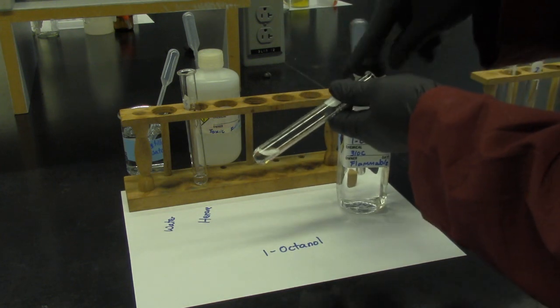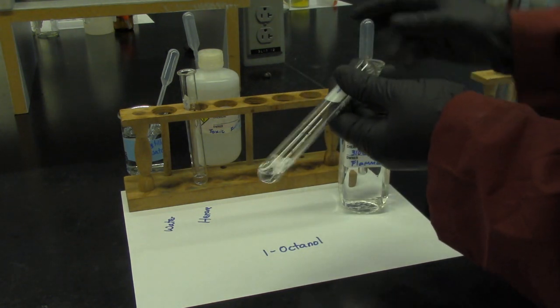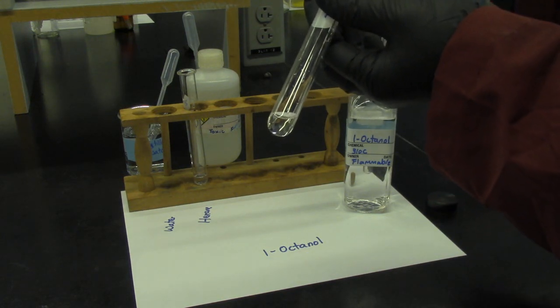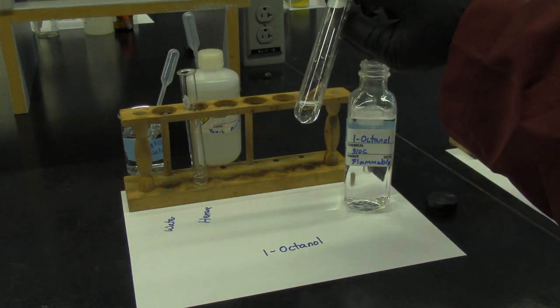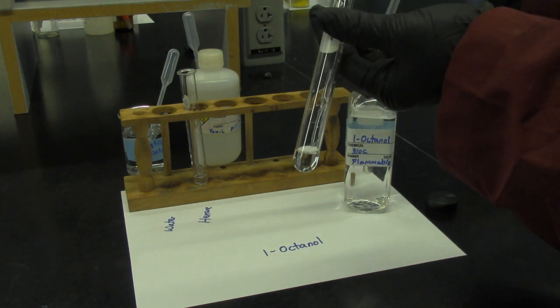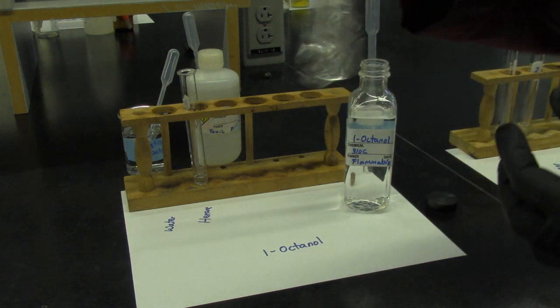First test tube with 1 ml of water and a few drops of octanol, 1, 2, 3, 4, 5. Shake, shake, shake.